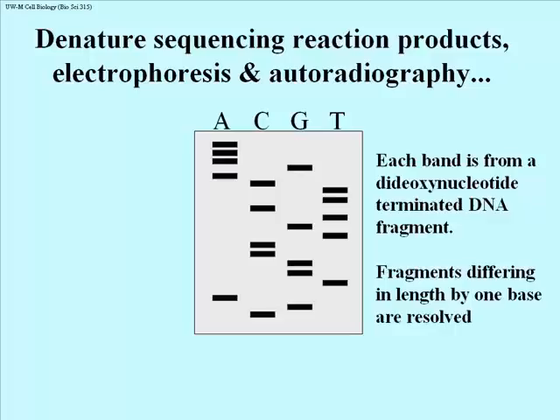What's really miraculous, if you want to think about it that way, I used to say in classes, this is about as miraculous as a 747 getting off the ground. This is a length separation, a size separation. Each band is separated from its nearest neighbor by the amount of DNA in one nucleotide.